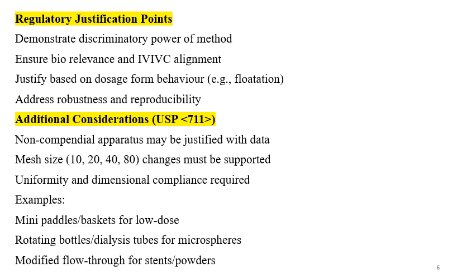Regulatory justification points are there, like demonstrating the discriminatory power, ensuring the biorelevance and the IVIVC, justifying based on the dosage form behavior, and addressing the robustness and reproducibility. So all these points are required to be considered whenever the dissolution test apparatus is being selected.